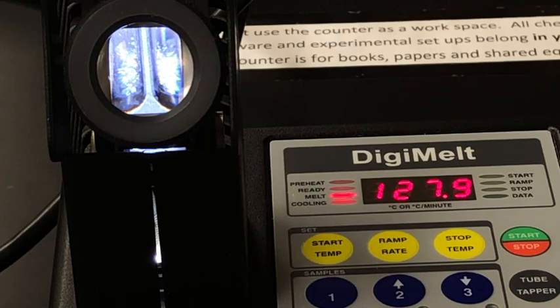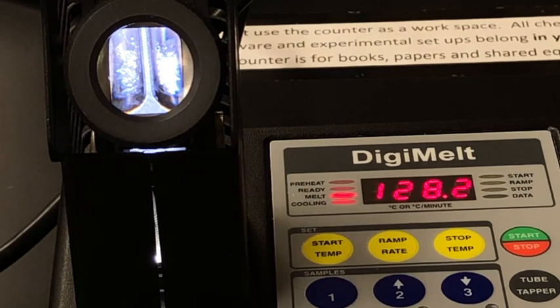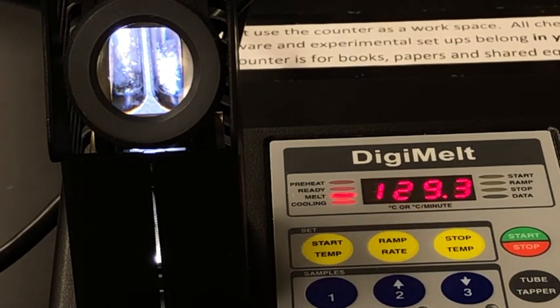I can definitely see a change in the solid — it looks like it's about to melt on the left side, which is our sample of aspirin. Once we start to see some liquid form we can write down the melting point of our sample. It's a little hard to see but liquid is forming, so we'll write down that initial melting point and wait for the rest of the sample to melt, then write down a final melting point so that we have a range.